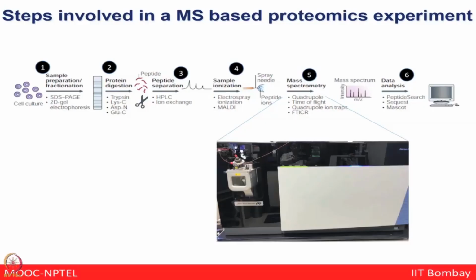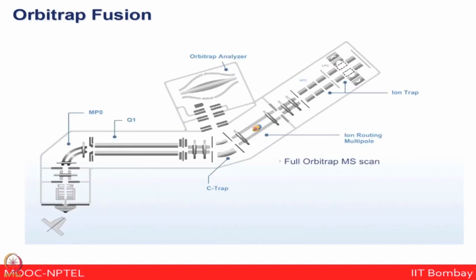So, then comes how to best separate these ions based on the mass to charge ratios, and that is where the latest technology like Orbitrap Fusion could be very helpful. We have already talked to you about the multi-TOF or Q-TOF kind of configuration, which was hybrid technology, but this particular technology is known as the tribrid technology. Of course, here you can use any of those configurations of quadrupole, time of flight, or even the Orbitraps, but I will just talk to you briefly about Orbitrap Fusion technology, which we are using more in our lab and is a very robust, latest advancement.